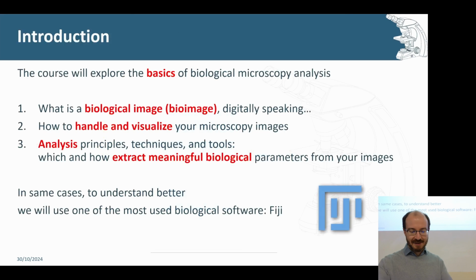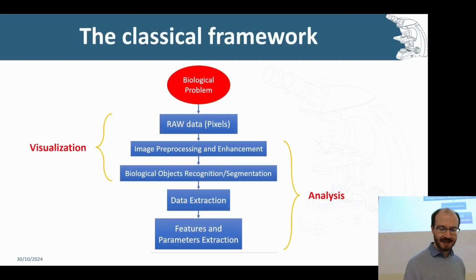Maybe just the software, you would have all known this by now, but we will be using Fiji as a base for this, but there are many alternative pieces of software that can do almost the same things. Fiji is obviously a free, great open source, massive community tool, and that's why we're using that.